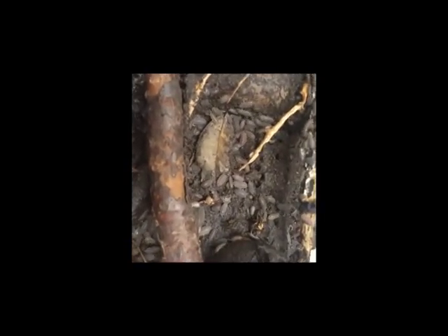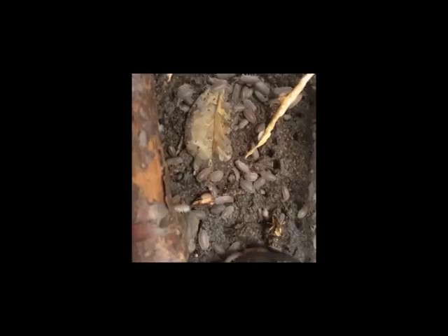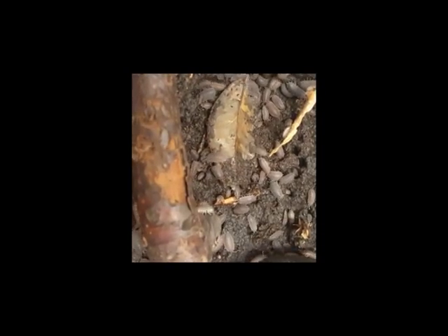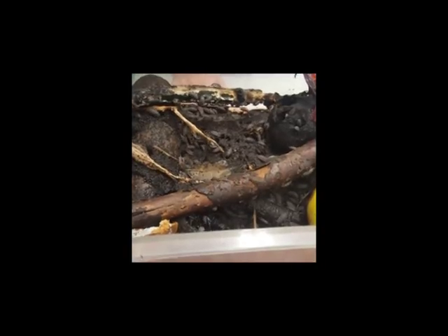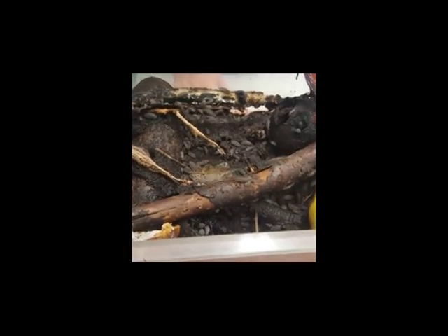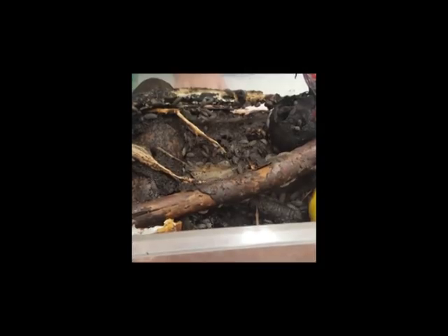These, my ladies, are called wood lice. They live on dead and rotting foods, as our pine of granites is showing you there. They also live in shaded, very moist areas because they need to make sure they've got enough moisture to keep themselves working, as they rely on absorbing oxygen from the atmosphere and they can't do that if they dry out.